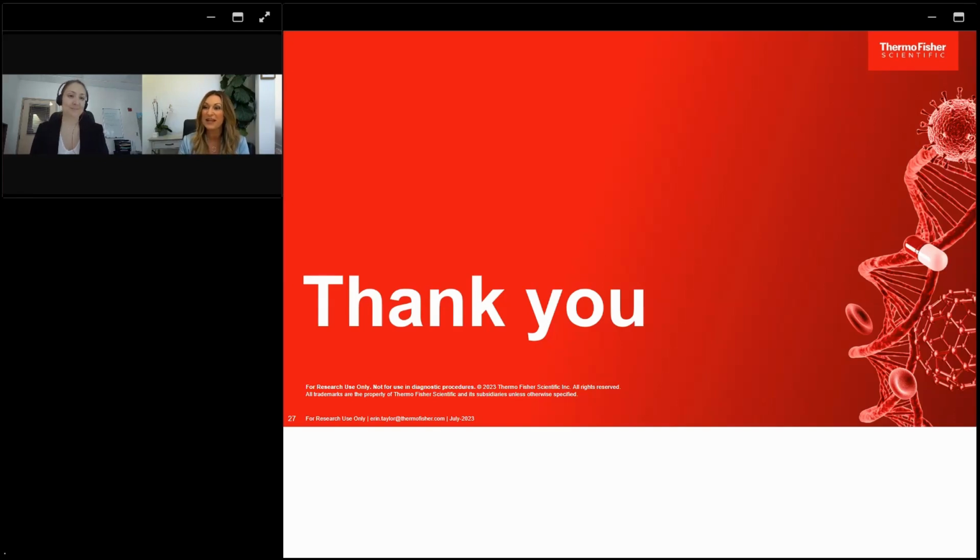The other part was, could we have some instruction for adding the image analysis to the standard gating procedure? I'll have to double check and see where we might have those instructions available. If you have the Attune CytPix, you're able to collect the images, and then I would suggest getting in touch with your rep for further guidance that's specific to your sample types. They would probably have some really good feedback or would know who to connect with.